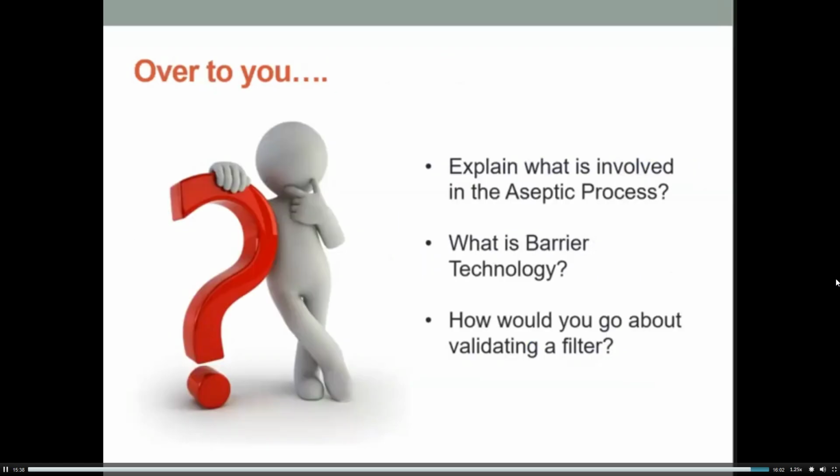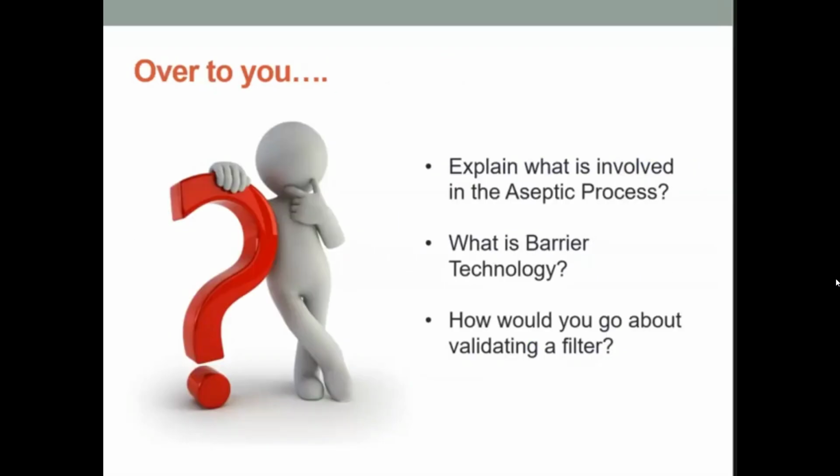Over to you. Can you explain what is involved in the aseptic process? What is barrier technology? How would you go about validating a filter?